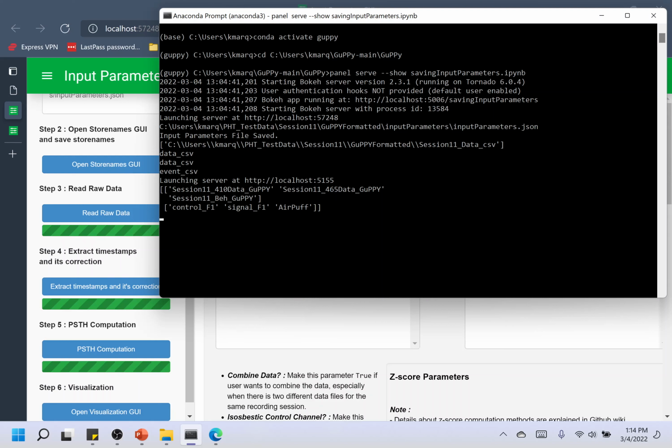And the reason I'm going into this and the fact that I ran into multiple errors is you can read more about them in the written part of this post. But just be aware that errors will occur and they will show up in the Anaconda prompt.